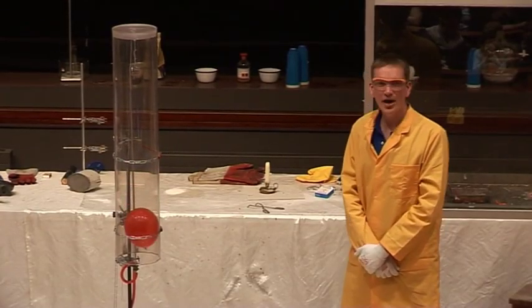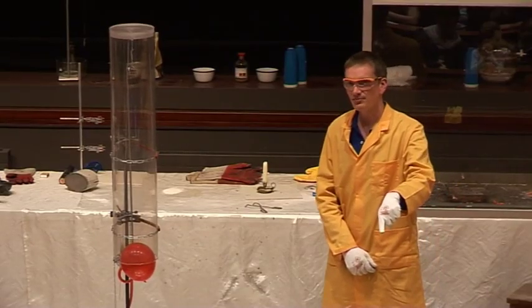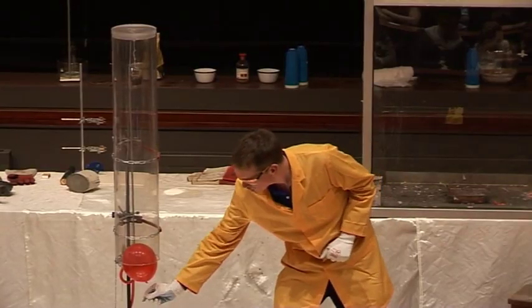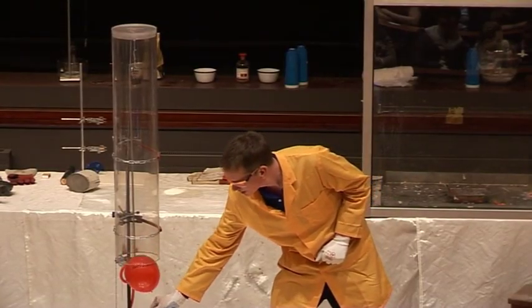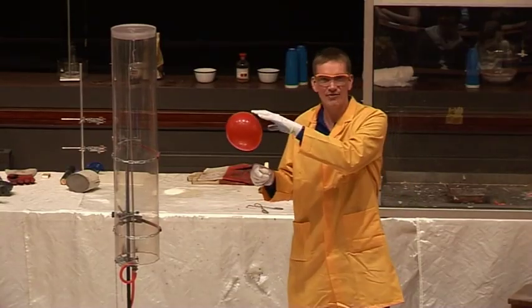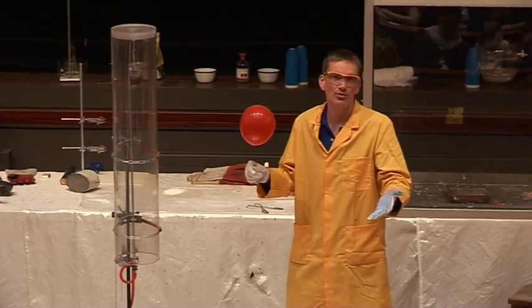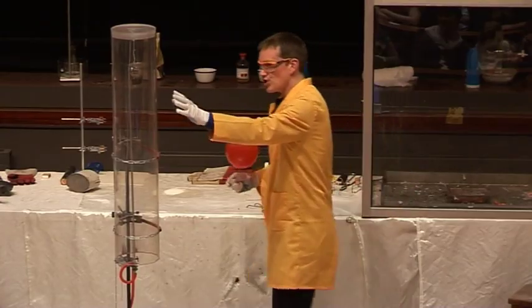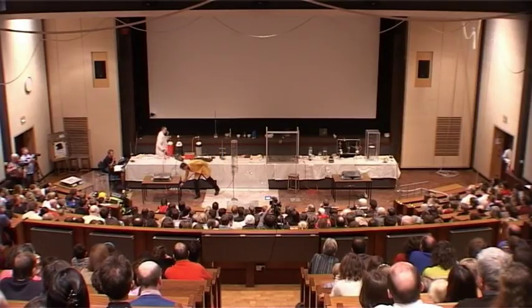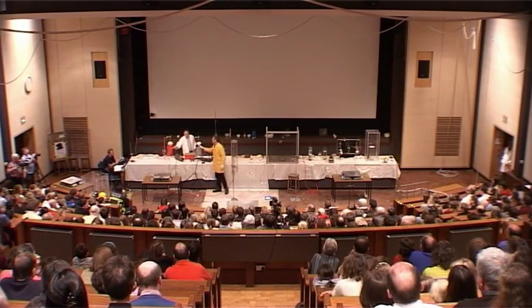Well, remember, hydrogen floats in air, but the air balloon didn't float in air because the balloon itself was slightly heavier. Well, what we've done now is fill this tube up with hydrogen gas, and so the balloon no longer floats inside it because the balloon itself is heavier. So hydrogen doesn't float in hydrogen, just like an air-filled balloon doesn't float in air. So this tube now contains hydrogen. Now, remember my oxygen gun?